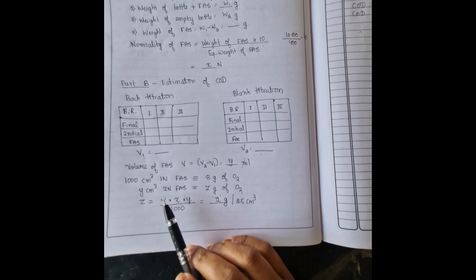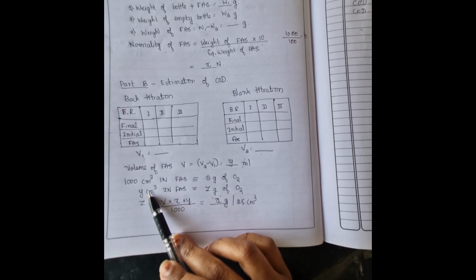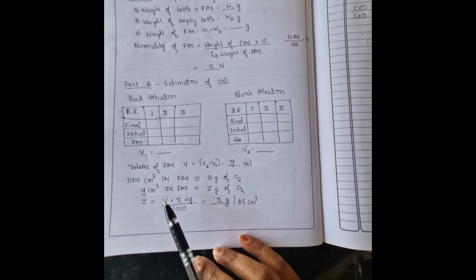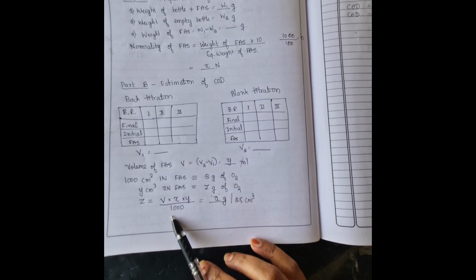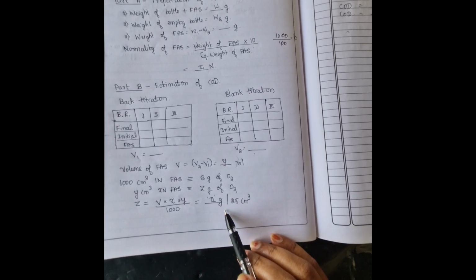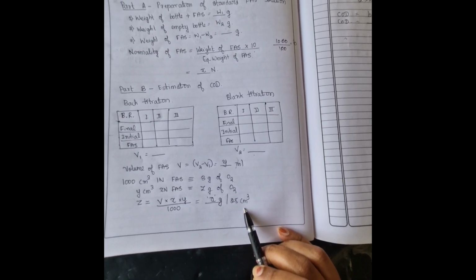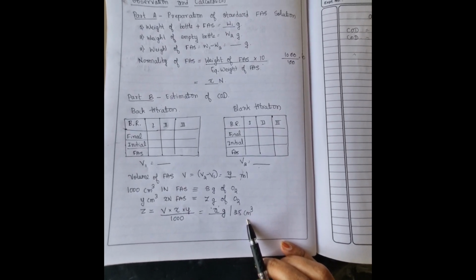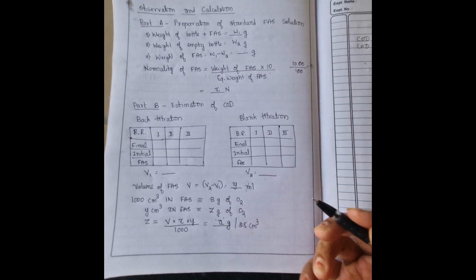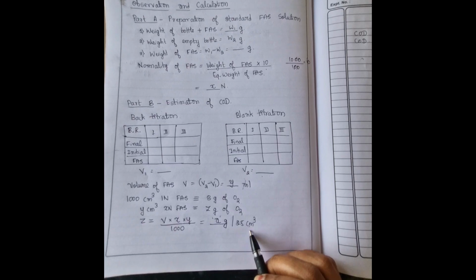That will be equal to the volume taken into X, the normality, and into Y, divided by 1000. That will give us A grams of oxygen, but that is for 25 ml only, since we are titrating only 25 ml of the analyte.